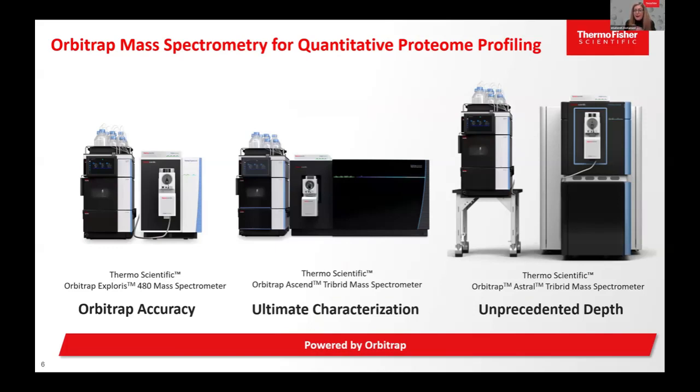We have been doing great in the DDA world. In recent years, DIA uptake is increasing. People are doing more DIA, and more software is being developed. DIA-NN, I would say, was a breakthrough in the DIA world, because before DIA-NN, you had to generate lots of spectral libraries to be able to increase your IDs. Now with DIA-NN, the spectral library match-between-runs, and even Chimerys, which my colleague is going to provide more information on later today, is enabling the uptake of the DIA method.